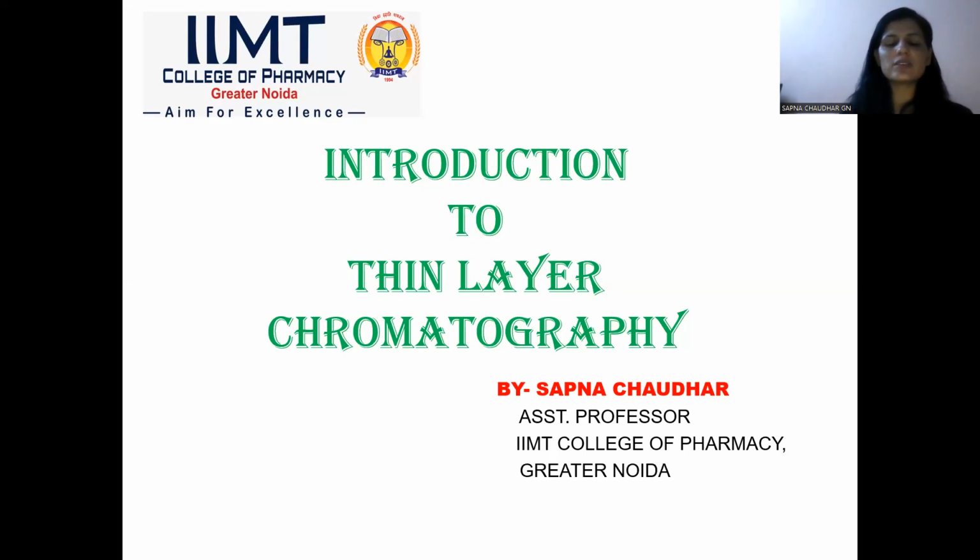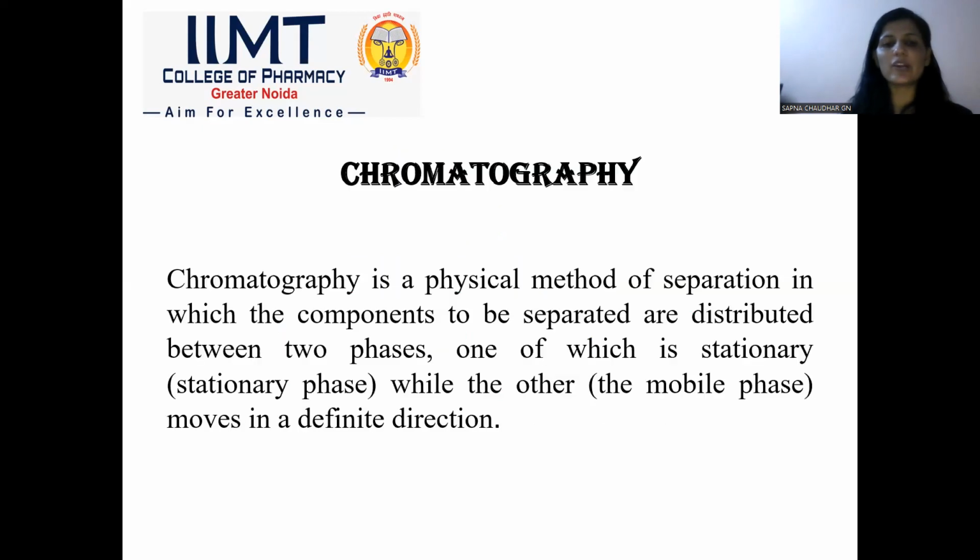Today, we are going to discuss the introduction to thin layer chromatography. Basically, thin layer chromatography is shortly called TLC. So, firstly, the definition of chromatography.